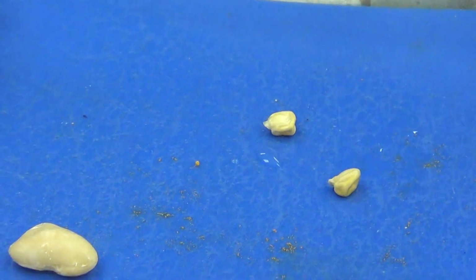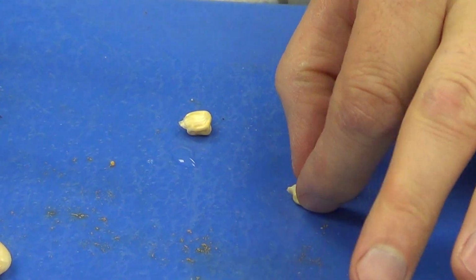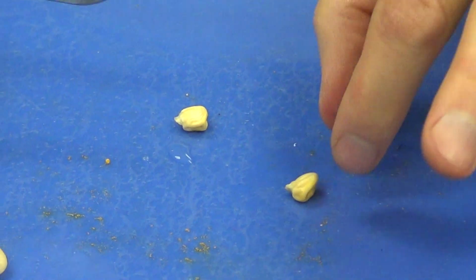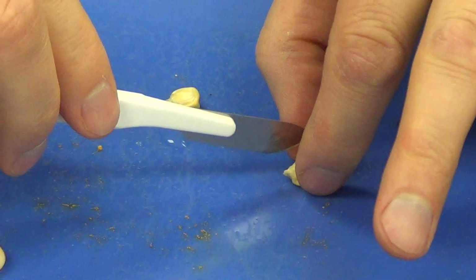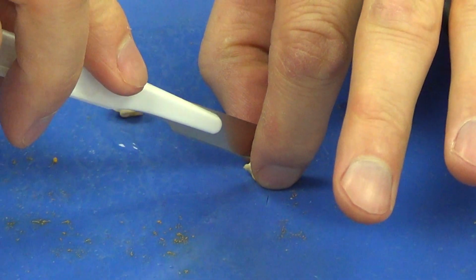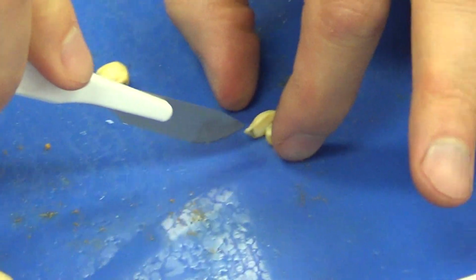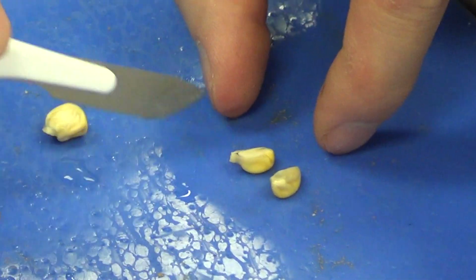I'm going to take my scalpel, and I'm going to cut that. Be very careful when you cut this. You do need to hold the seed, but be very careful how you actually cut this seed. So I'm going to cut right in the center of that white apron or embryo. And you can see I cut that right in half.